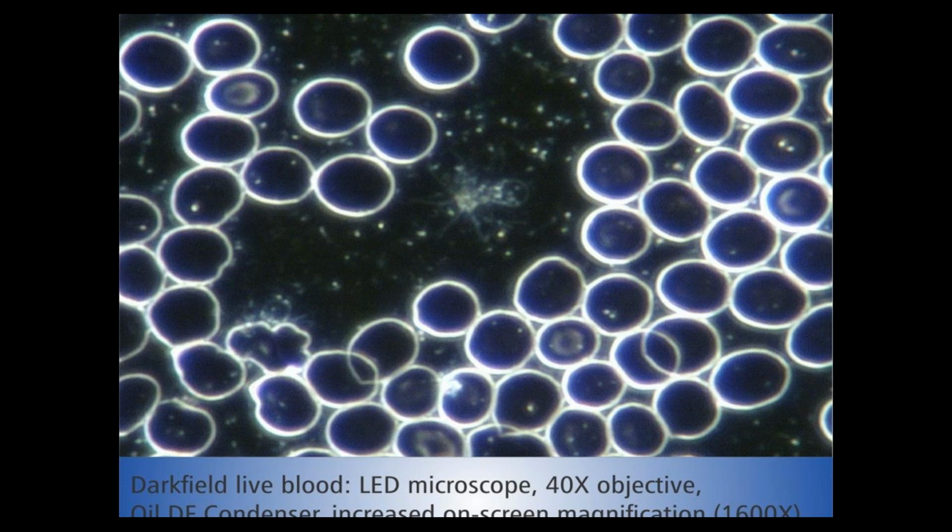Anything below that won't allow you to see enough detail to properly distinguish between and assess the different anomalies. So if you have a standard microscope set up to achieve a magnification of 1,000 times on the screen, you would need to use a 100 times objective.